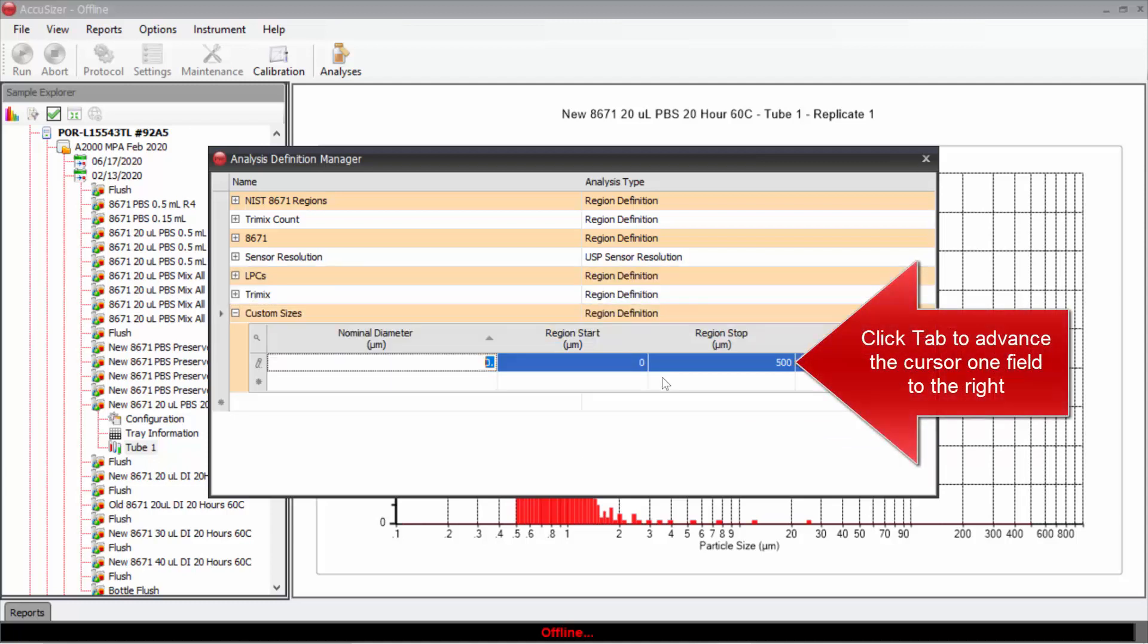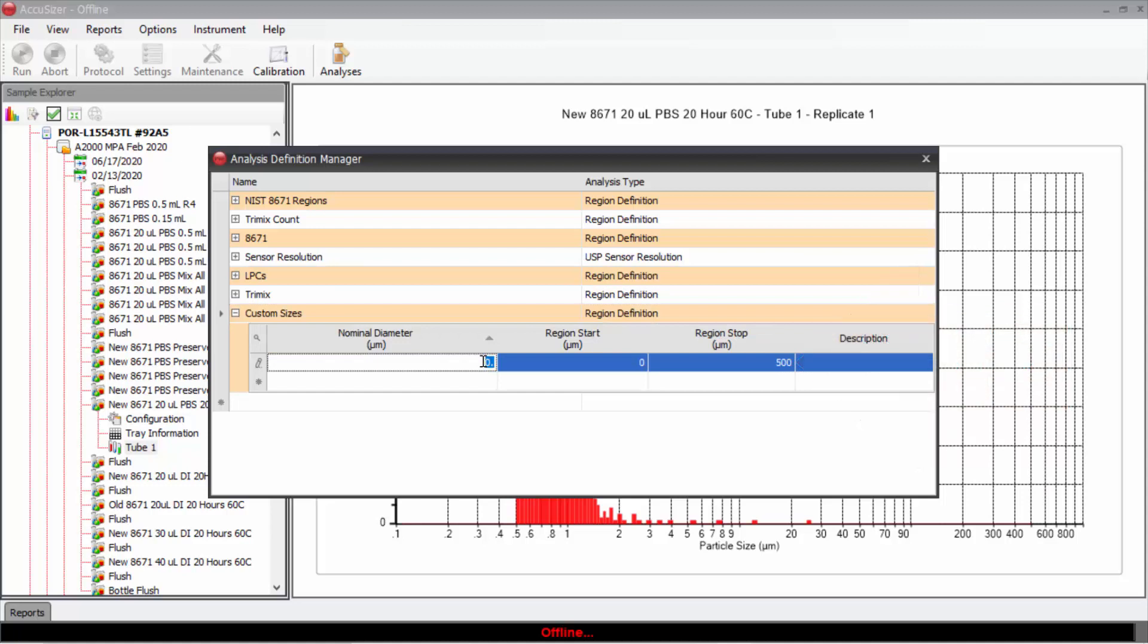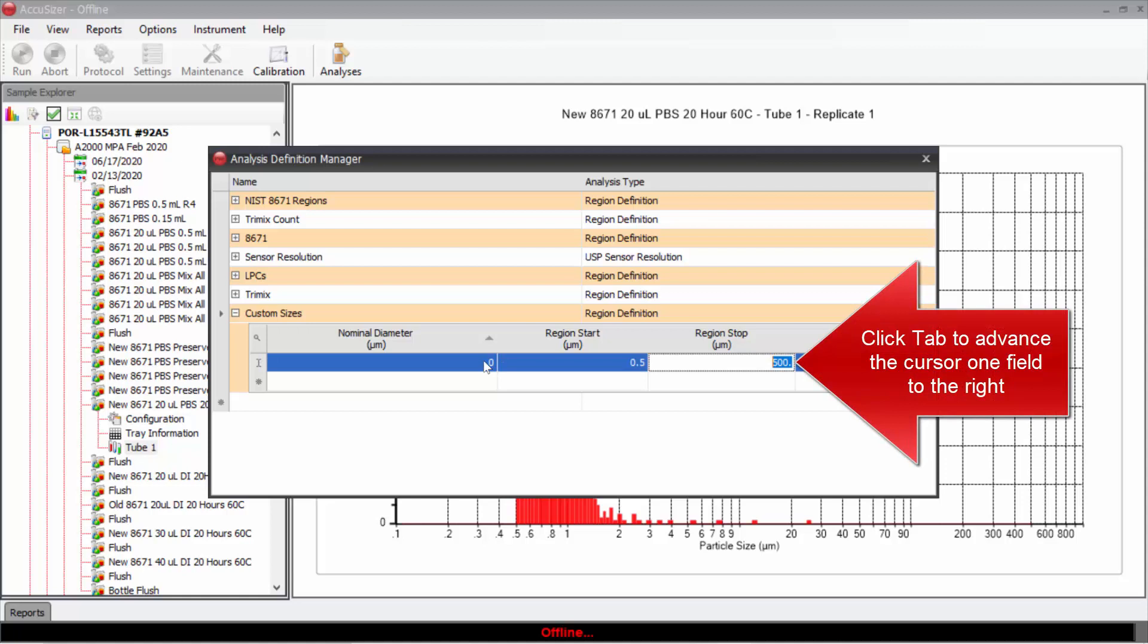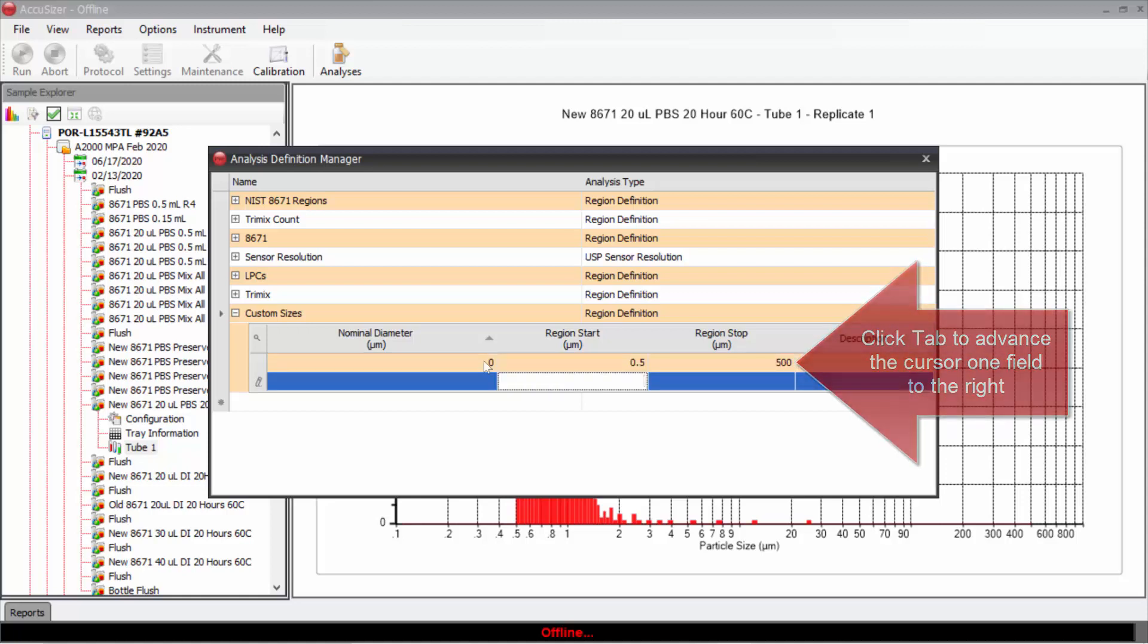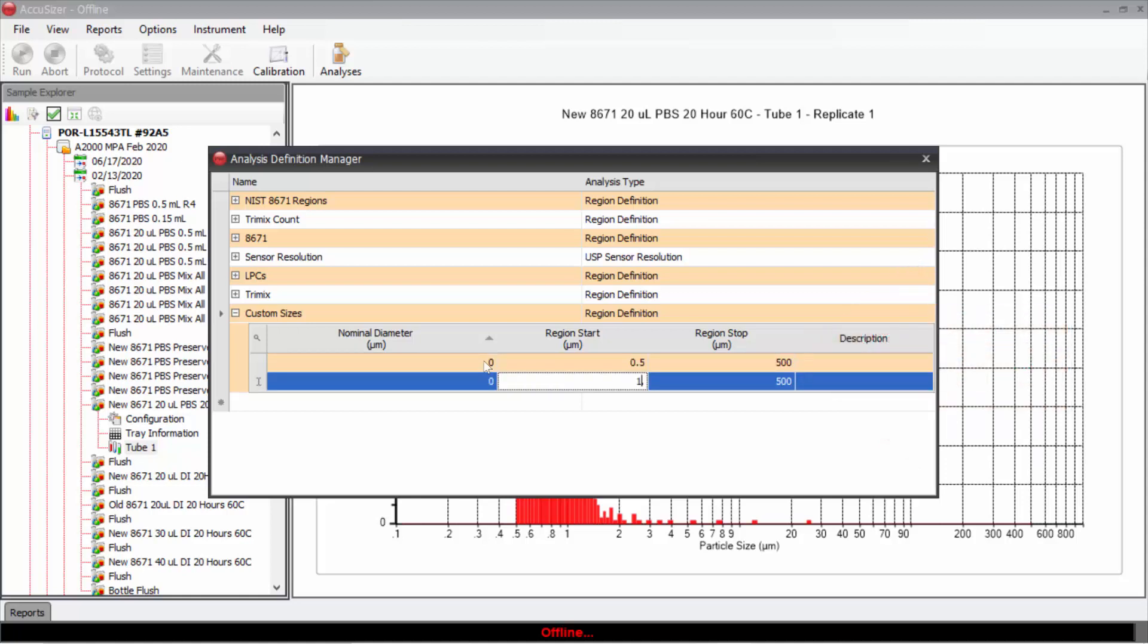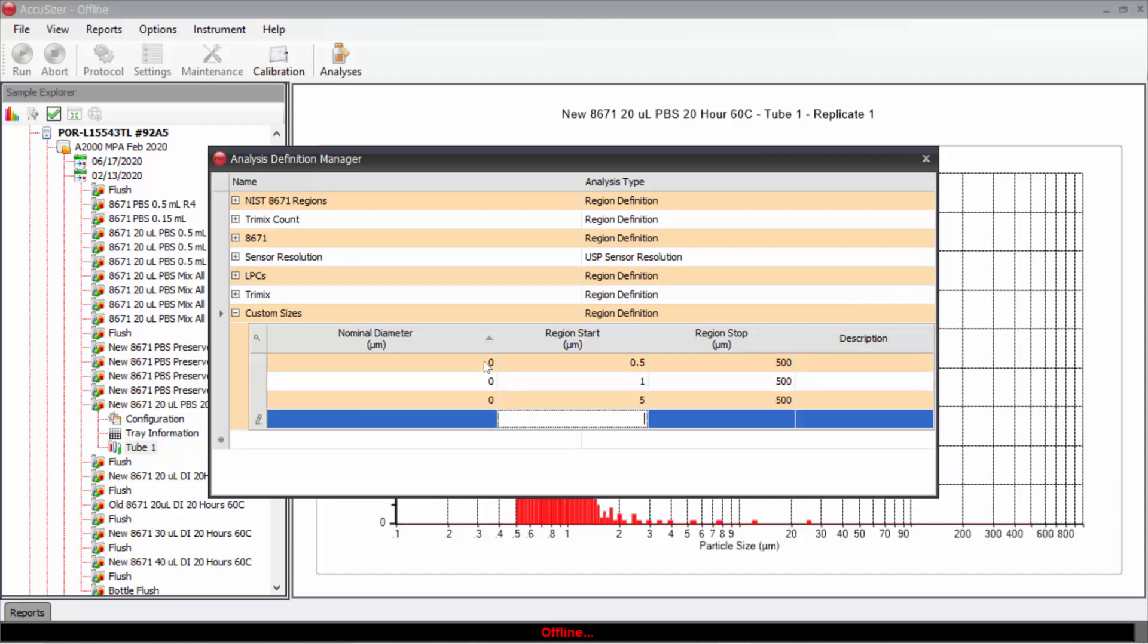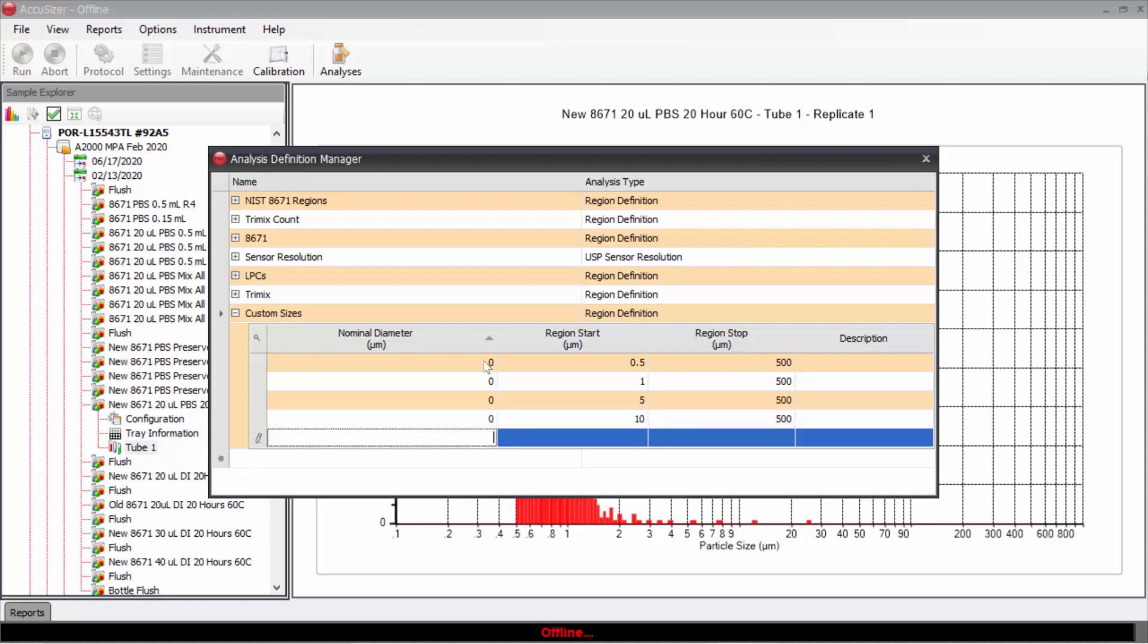Now I can click tab. I'm not going to enter a nominal diameter. I'm going to say for the first region, let's measure from 0.5 to 500, and then from say 1 micron to 500, from 5 microns to 500, and the final one we will make from 10 to 500 microns.